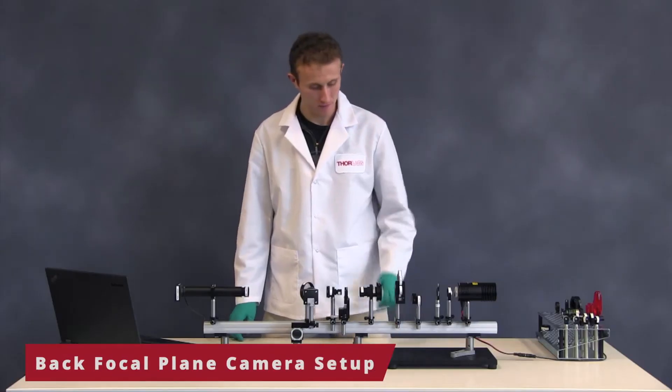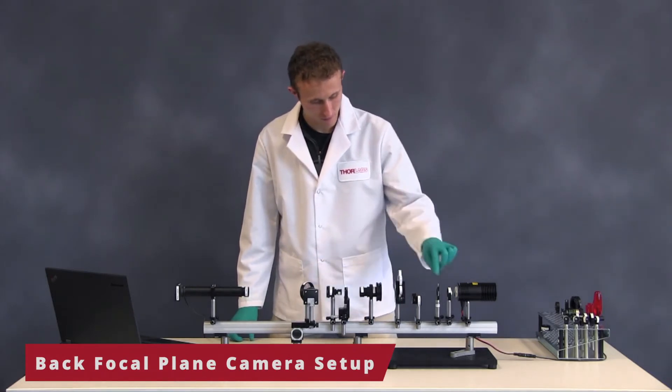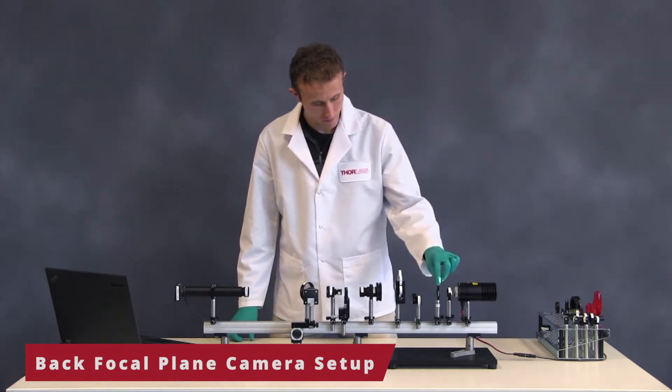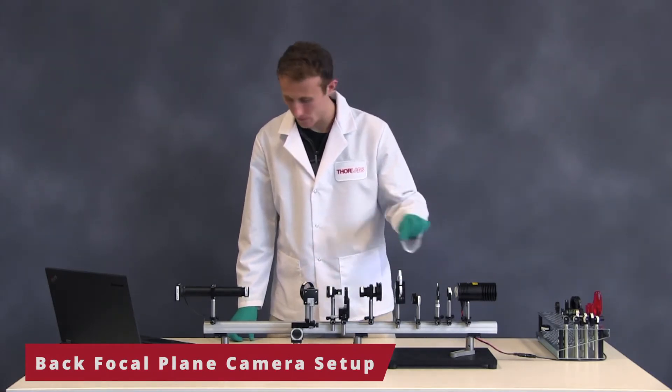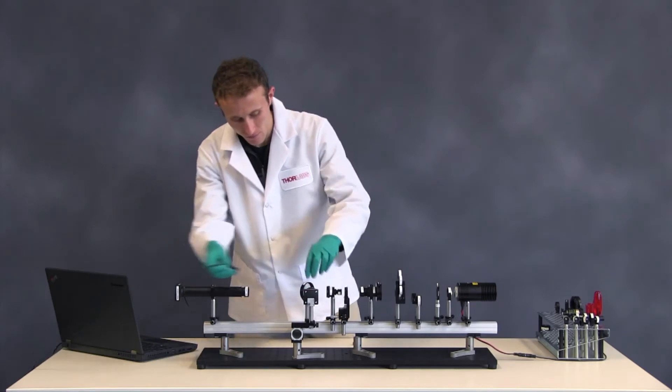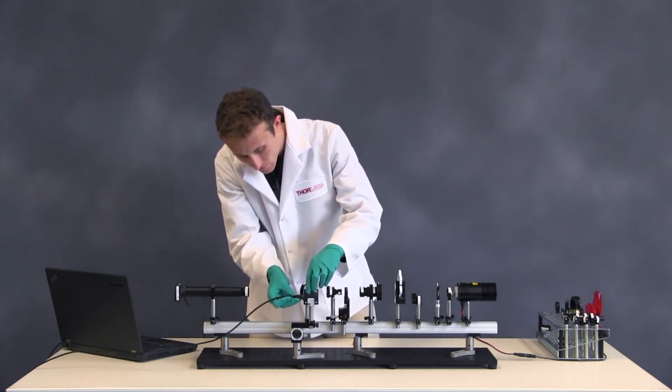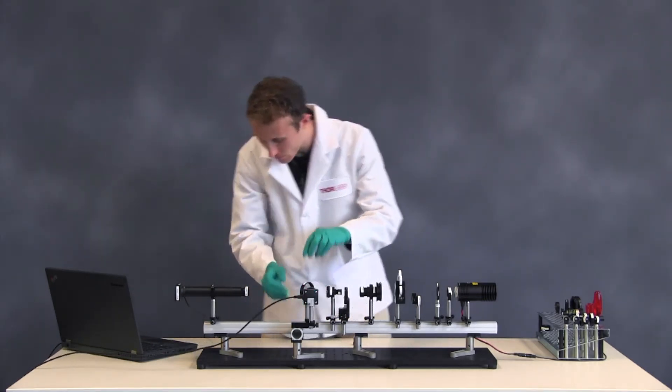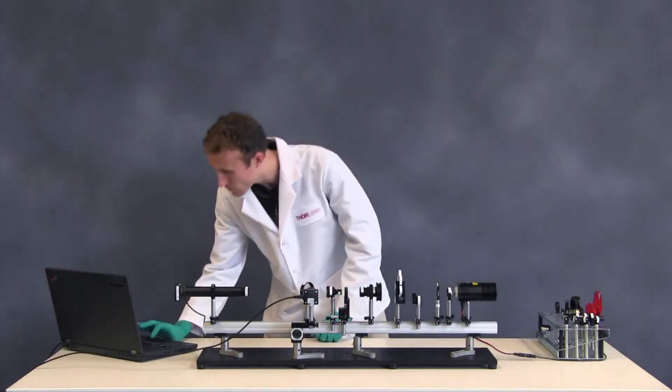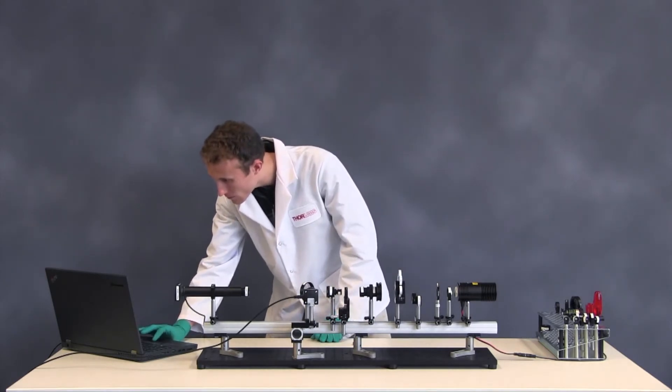To set up the color camera, open up the aperture iris and field iris. Connect the color camera. Open a window in the ThorCam software and adjust the exposure.